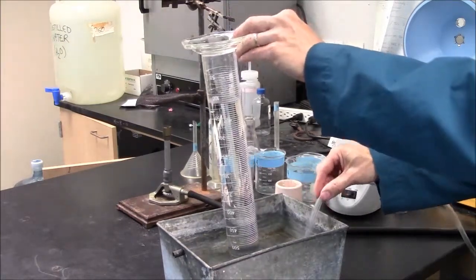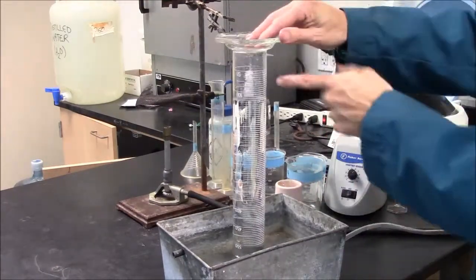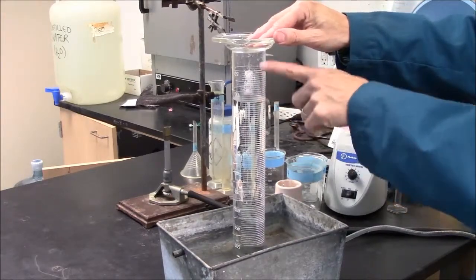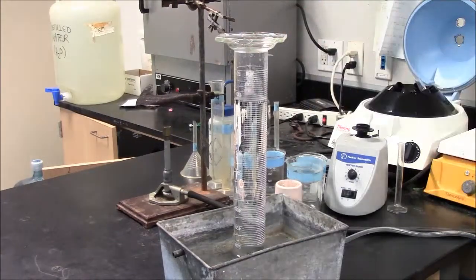To find the volume of gas collected we remove the tube from below and simply take the difference from where it began to where it ended. And this difference is the volume of gas produced in the reaction.